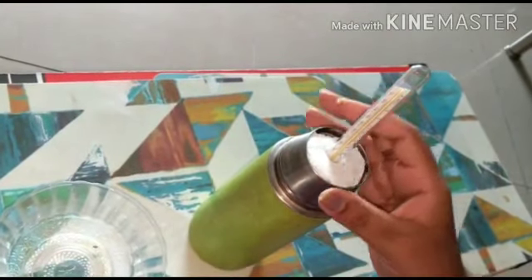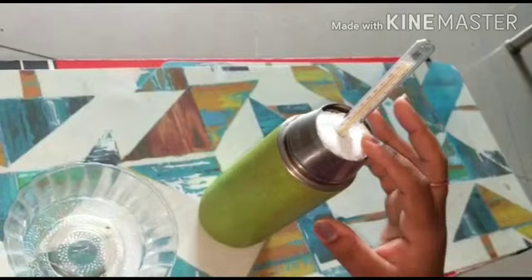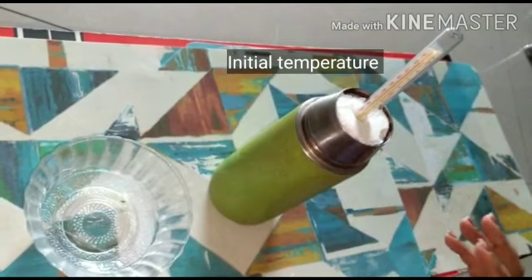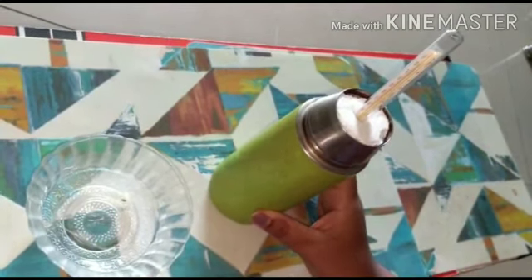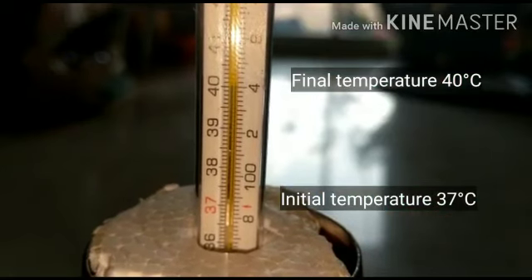Now, after closing the flask with the fitting cork and inserting the thermometer, take the initial reading of the temperature on the thermometer. Later, after every 2 hours, keep checking for the rise in temperature. Note the rise in temperature.